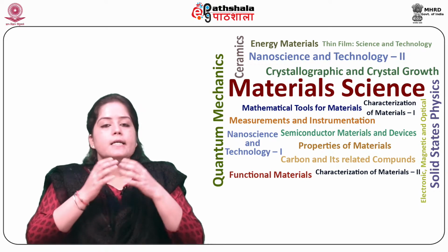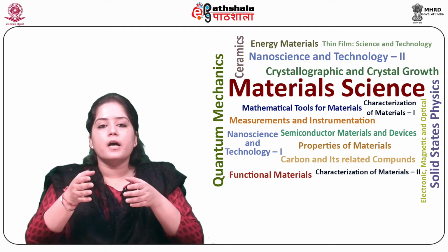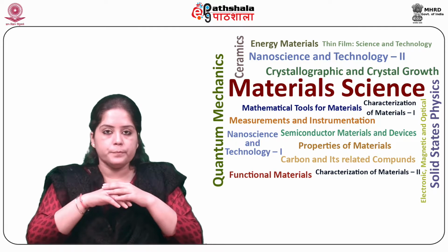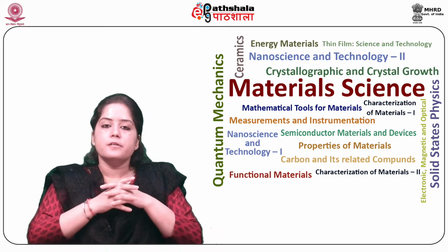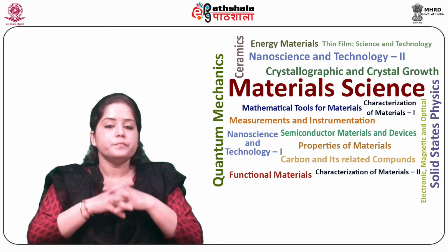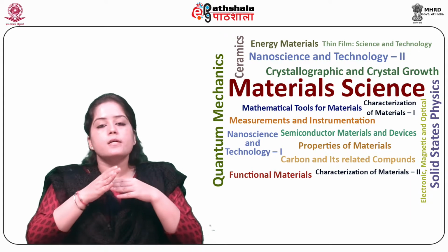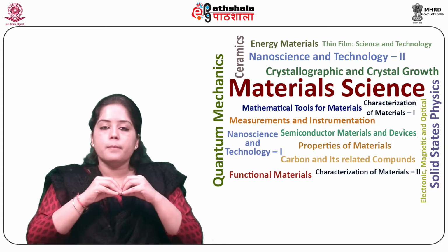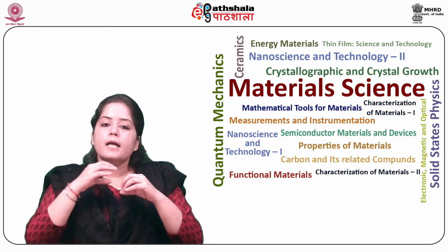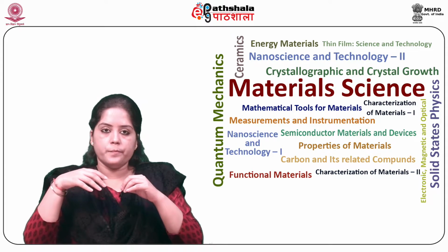FTIR stands for Fourier Transform Infrared Spectroscopy, the preferred method of infrared spectroscopy. When IR radiation is passed through a sample, some radiation is absorbed by the sample and some is passed through, or transmitted.